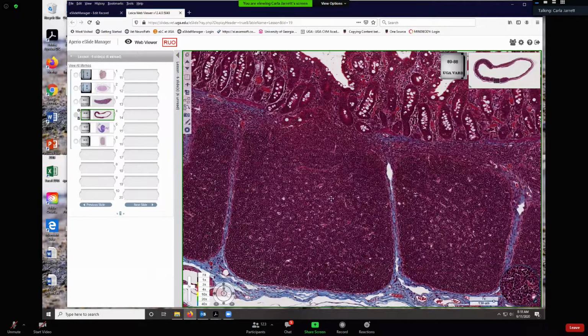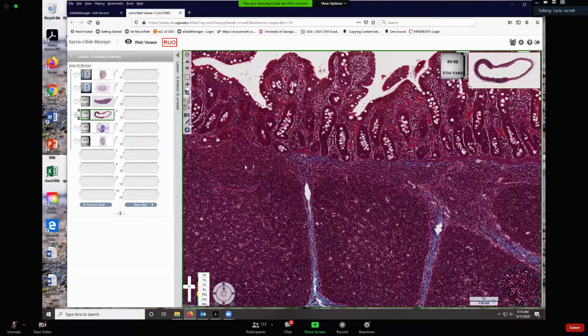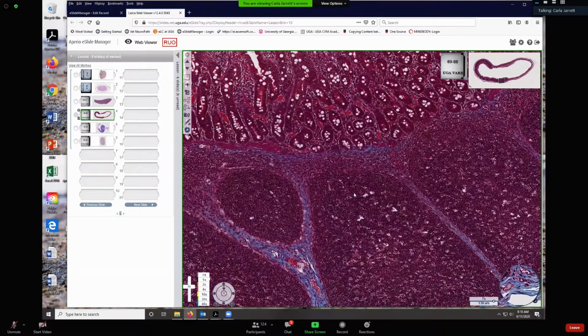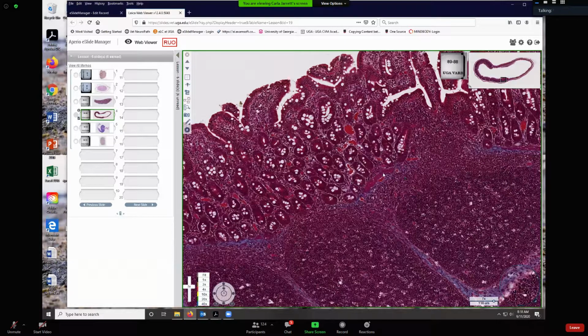Do know that they're nodular, and so therefore that's where B cells are located. Do recognize that the diffuse portion is the T cells. They tend to be just under the lamina muscularis here. They'll also kind of be in between the nodules, but mostly they'll be in this area between the nodule and up to the muscularis mucosa.